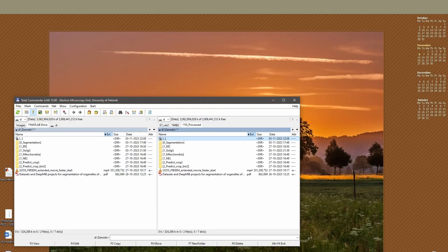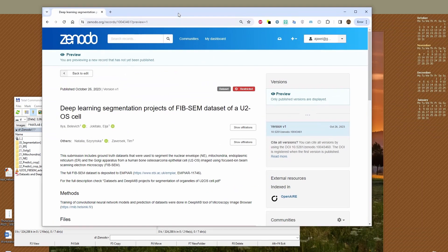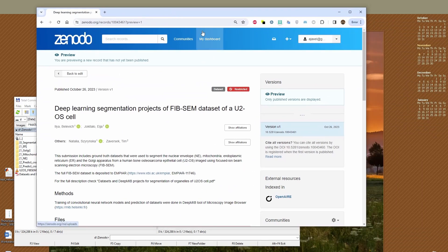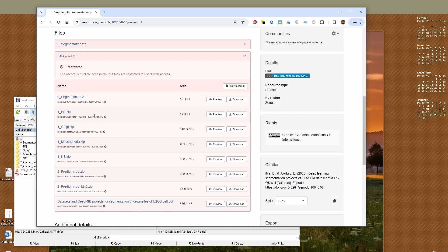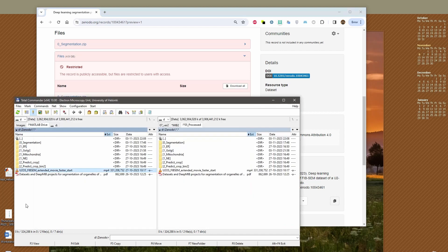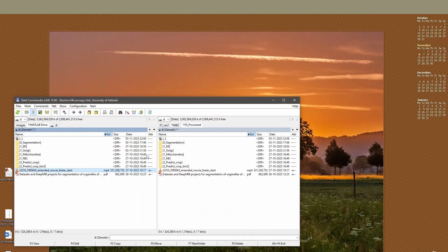The actual training data as well as the trained networks were deposited to a Zenodo document. When you open this document you can see that it contains several archives. In this video I'd like to go through these archives to show you how you can actually use them. I already unzipped everything to my drive, so let's see what we have.